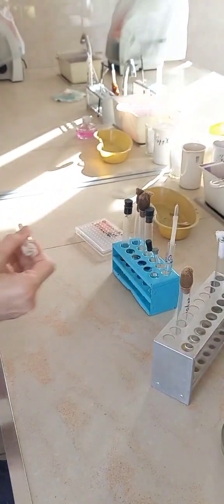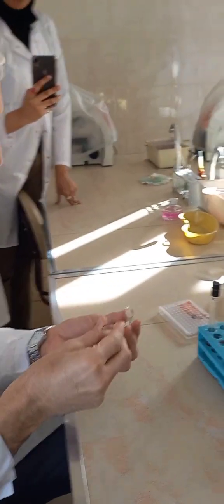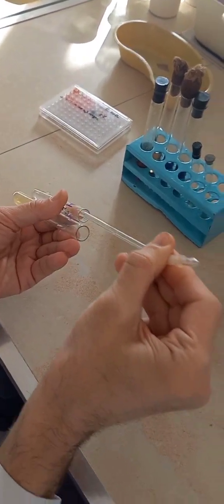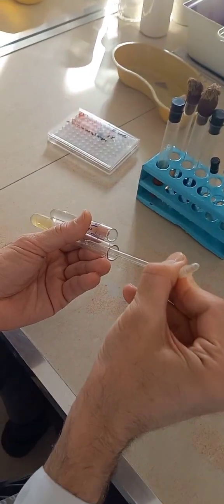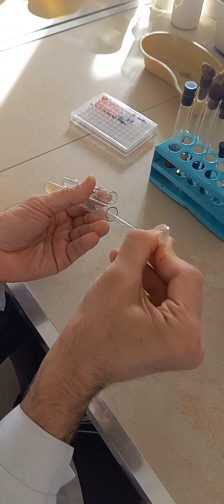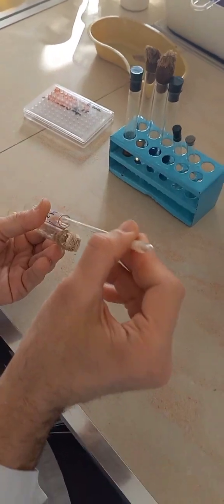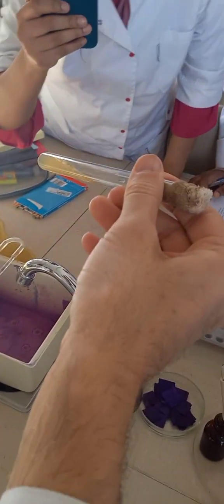So now here it is, first type. No, I will start from the second type of colonies. So people, as I said, after that with this culture, it is very difficult to do something more. Do you see microbes in not so perfect inoculation? Here they are. Now I try to load hydrogen peroxide directly upon them. Just a moment. Some bubbles look like appearing. Maybe not intensively, but something present, especially at the place of contact with microbe. Bubbling really present. You see, here they are microbes, and you see bubbling, right?